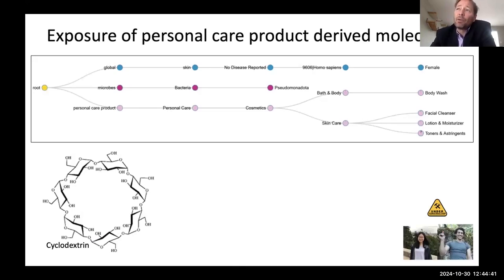In this U01, we're starting to collect reference data on personal care products. We're starting to collect reference data on the entire formulation of drugs, plastics, wood products, whatever people use on a daily basis, rubber from tires, etc. We're creating a reference data set. So far, we've really pushed the personal care product space a little bit more because we assumed that a lot of people would be exposed to them, and so it would be good to be able to observe those.